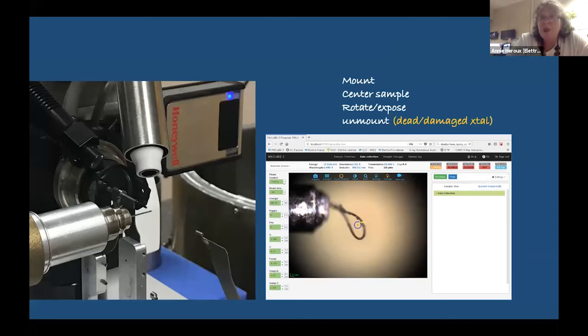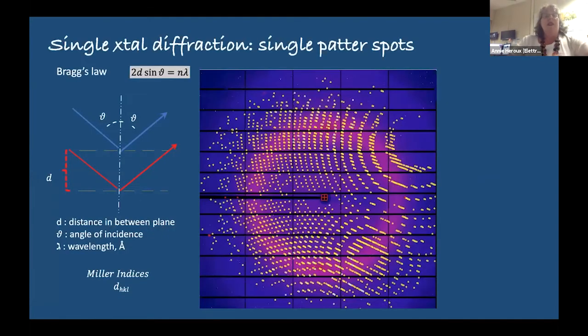So it's mature, but it's evolving very rapidly, and the users need to adapt to the new ways of doing things and be able to keep up. If you have 142 data sets within 2 or 3 hours, now the problem is for a human to manage all of that data and organize it. So there are databases now in place that will help you manage your experiments and figure out the best results that you have.